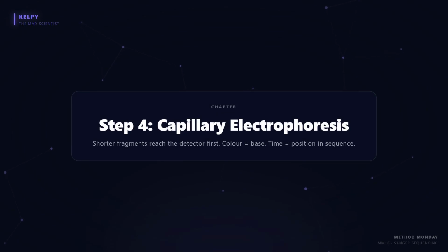Step 4. Capillary electrophoresis. Your core facility handles injection. But understand the physics. Your cleaned, resuspended fragments are denatured to single-stranded form in formamide and injected into a polymer-filled glass capillary under high voltage. Shorter fragments migrate faster through the polymer and reach the laser detector first.